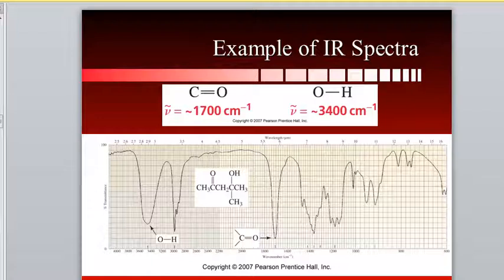But I should be able to pick up the big ones. That's a big dominant one. I see that immediately just by looking at it. I should be able to tell what that one is. This one, that's a big band. I should be able to tell you what that represents. This one, that's another very dominant band that my eyes immediately go to when I see the spectrum. I should be able to tell you where that's coming from.